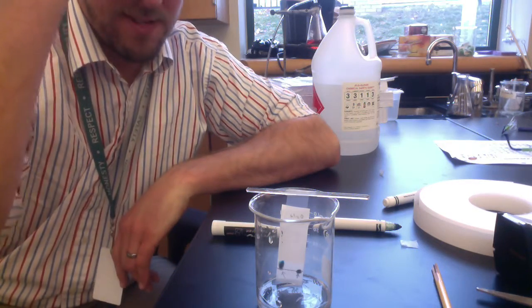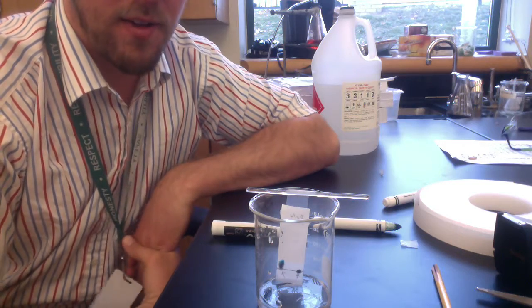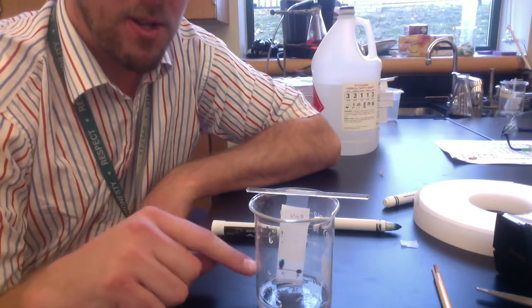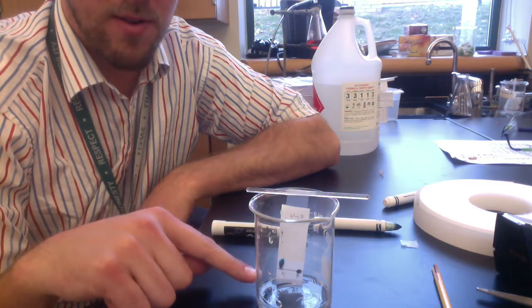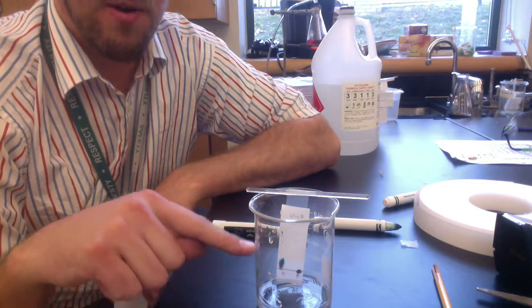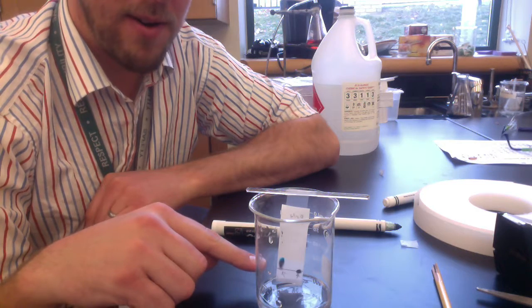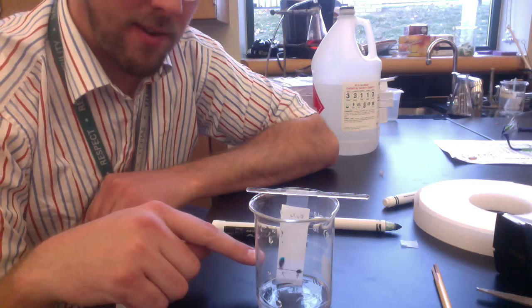And once again, referencing the Google slides, there's something you can actually measure about this called the Rf value. It stands for retention factor. It's basically a rating of how much your solvent, the liquid, drags that solute, the solid thing, the pigment, the ink, up your paper. Take a look at the diagram on the Google slides, but that's one thing I want you to measure about this experiment: how much the various components of your ink get moved.